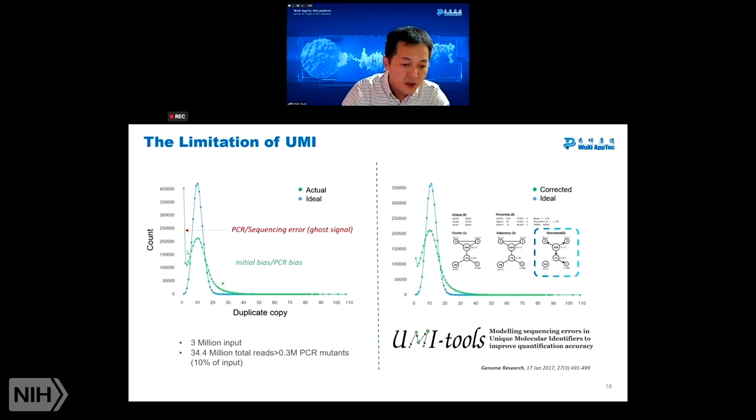If you simply use an uncorrected aggregation method, each species of these will be counted as a unique sequence. But the distribution, as you can see here, actually forms almost a different population than the major distribution.